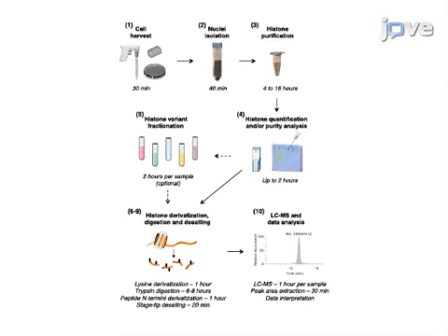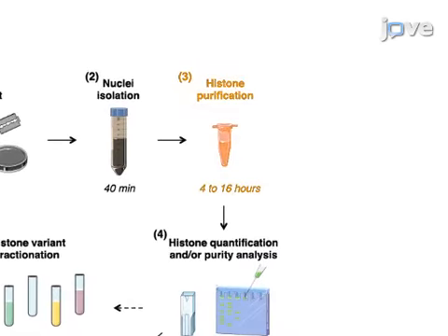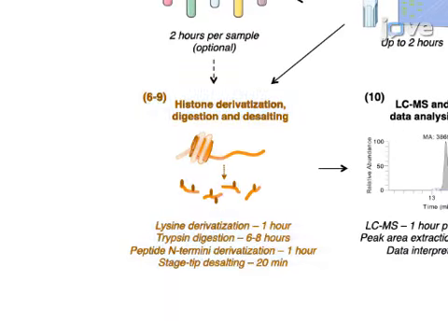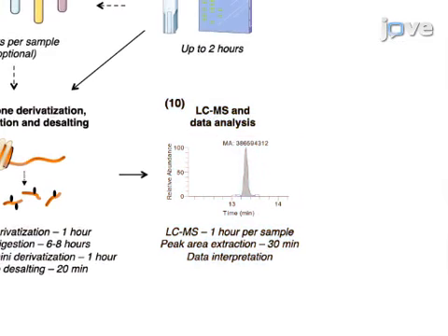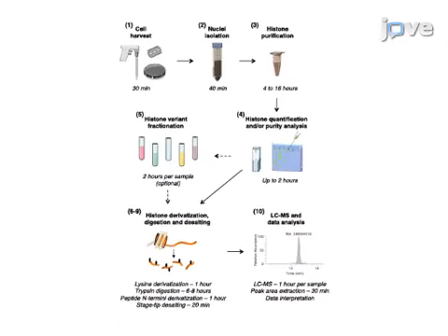As shown in this workflow, this is a 10-step protocol that includes histone purification from cell cultures or tissues, histone derivatization, digestion and desalting, and mass spectrometry analysis using nano-flow liquid chromatography. Only selected procedures will be demonstrated in this video.